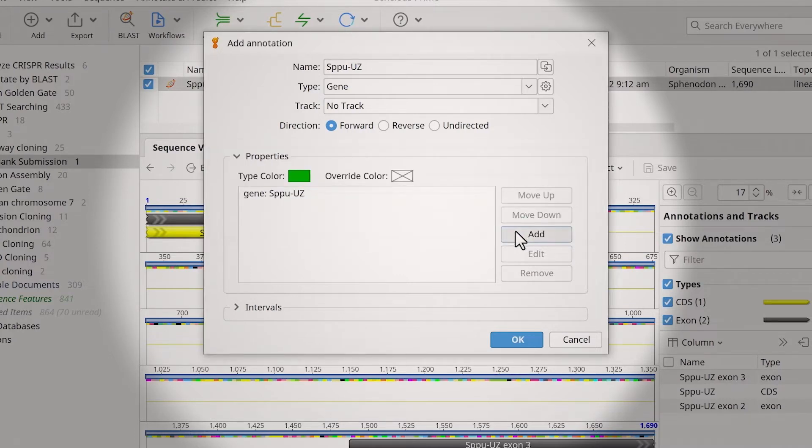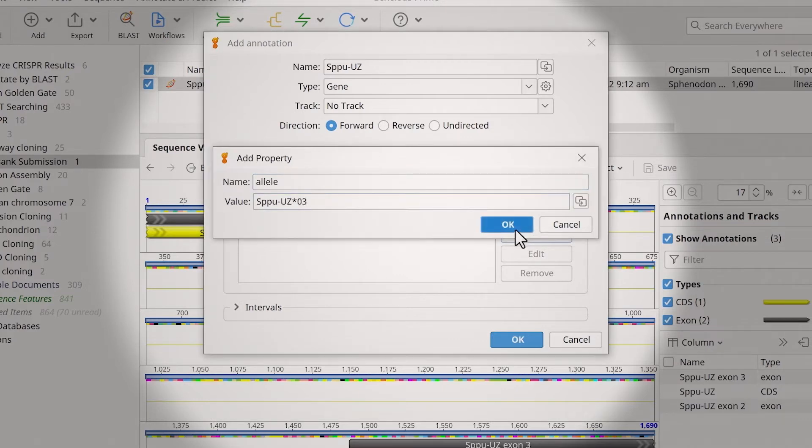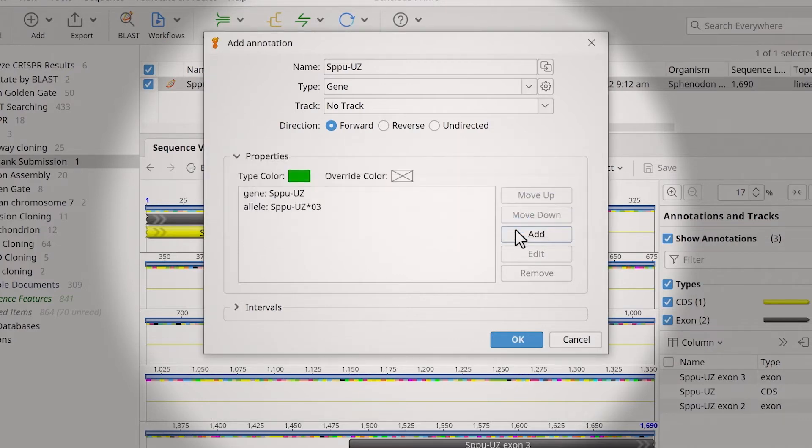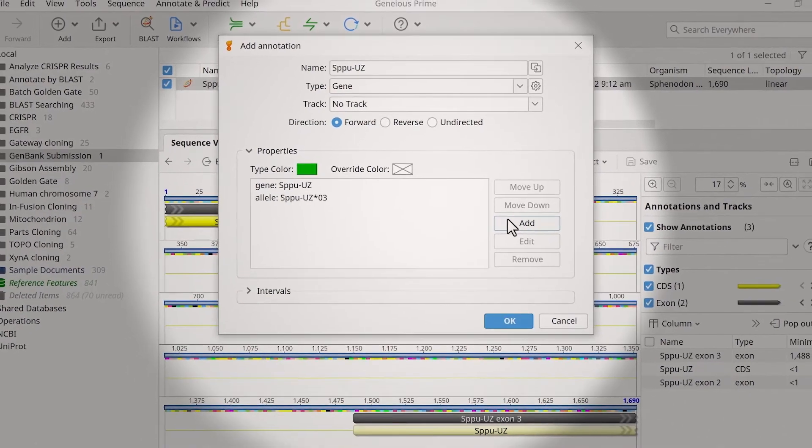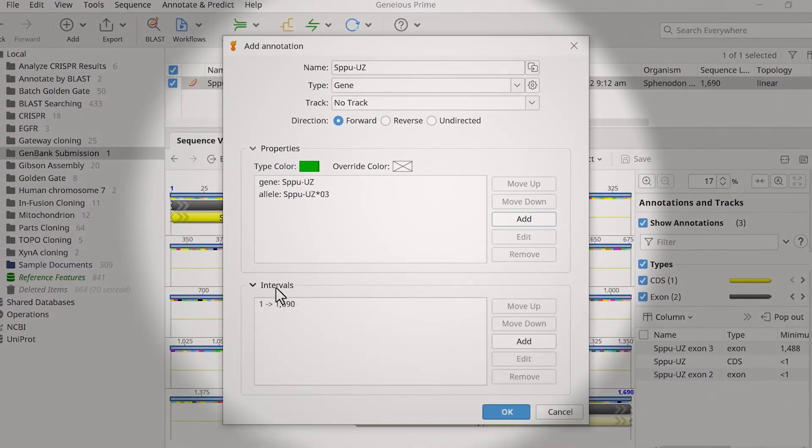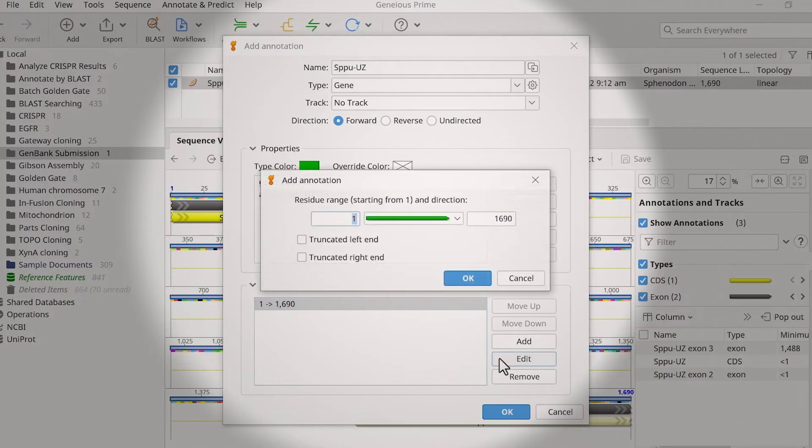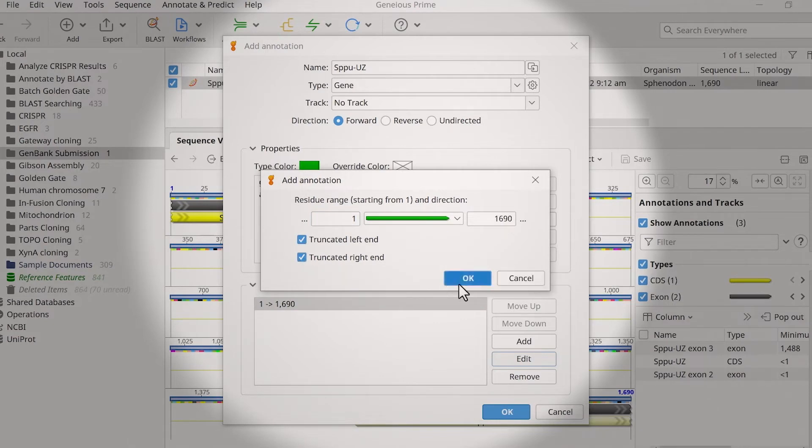You can add optional qualifiers to genes in much the same way. If your sequence represents only a fragment of a gene, you must indicate that the gene annotation represents a partial feature. To do this, expand the interval options and edit the interval in the table. Then check the appropriate options in the new window to indicate where the sequence is truncated and click OK.